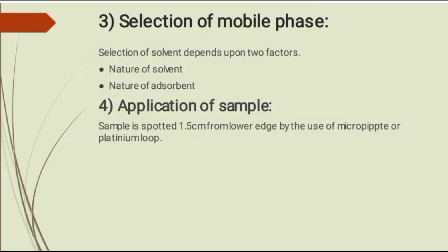Third step is selection of mobile phase. Selection of solvent depends upon two factors. Number one is nature of solvent and number two is nature of adsorbent.